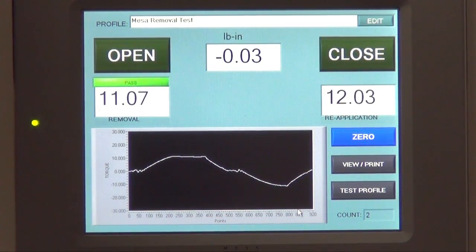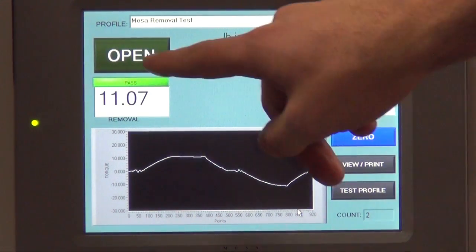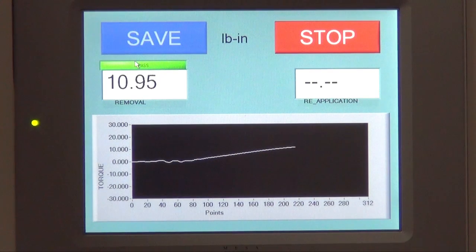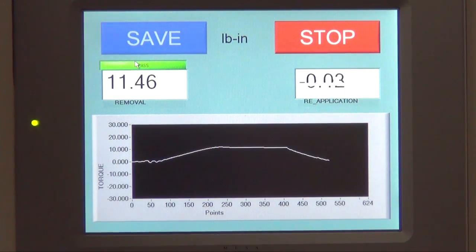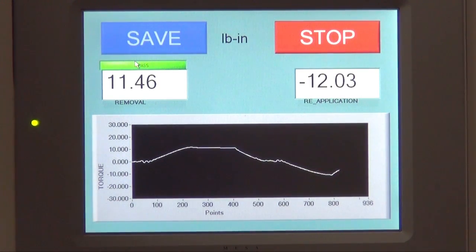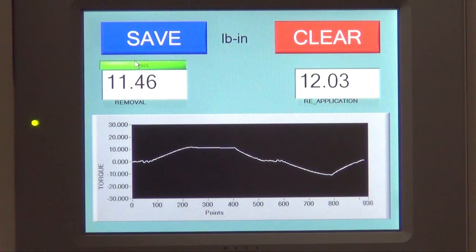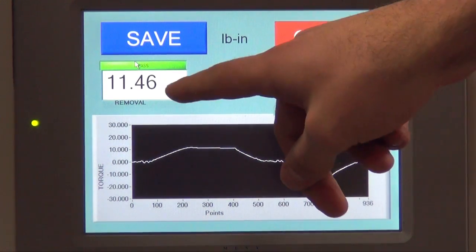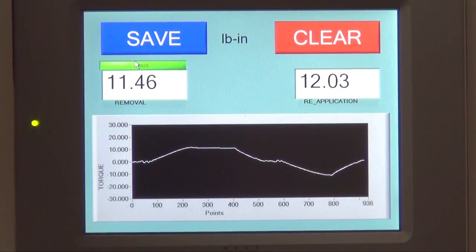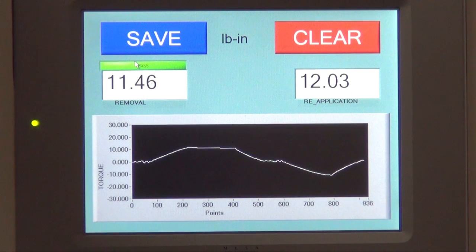Once the bottle is secure and the chuck is engaged properly on the cap, simply press the open tab to start test. The test should only take a couple seconds. On this screen, it will show you what your peak removal test was on the left hand side and also what it reapplied the cap to on the right hand side.